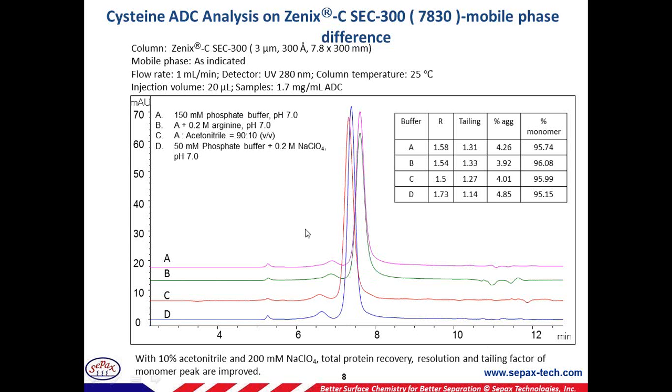And also, a lot of people use SEC for LCMS to determine intact mAb mass and also intact Herceptin lysine ADCs. For cysteines, due to the non-covalently linked subunits, once you have the drugs conjugated to the mAb, it will dissociate into different subunits, with some of the disulfides still intact, under the non-reducing but volatile denaturing mobile phase here. So in this case we have 0.1% TFA, 0.1% formic acid, and 20% acetonitrile.